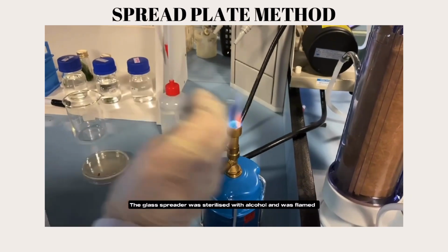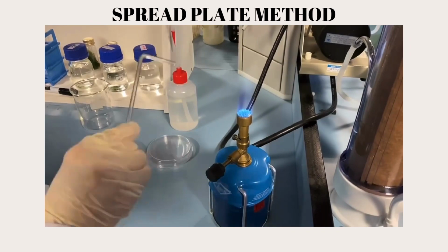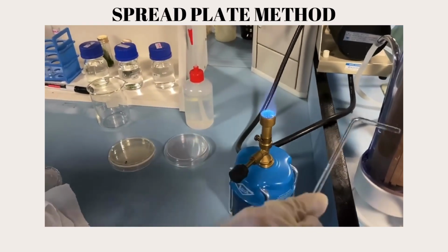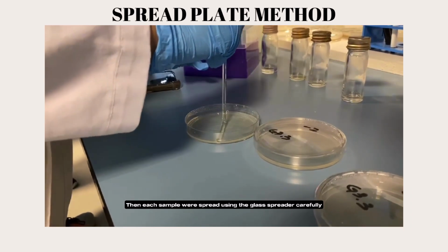The glass spreader was sterilized with alcohol and was flamed. Then, each sample was spread using the glass spreader carefully.